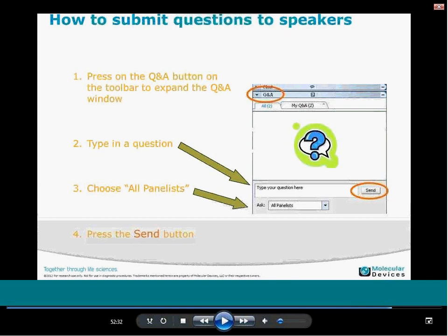A couple of questions have turned up. One of which is how long each measurement can take to be run. That is an obviously difficult question to answer, considering that it depends mainly on the module and the image complexity.